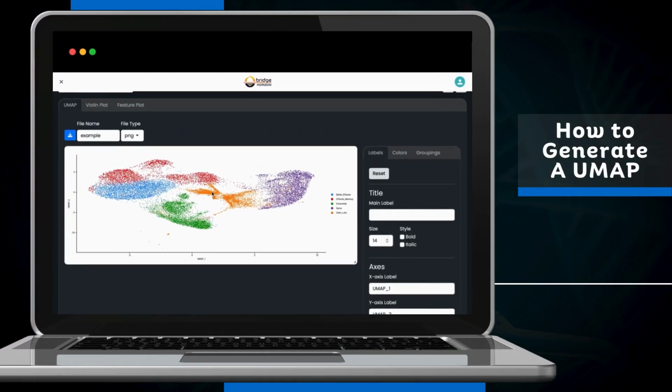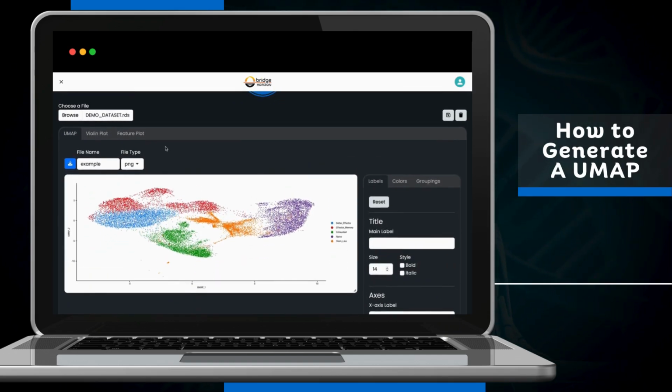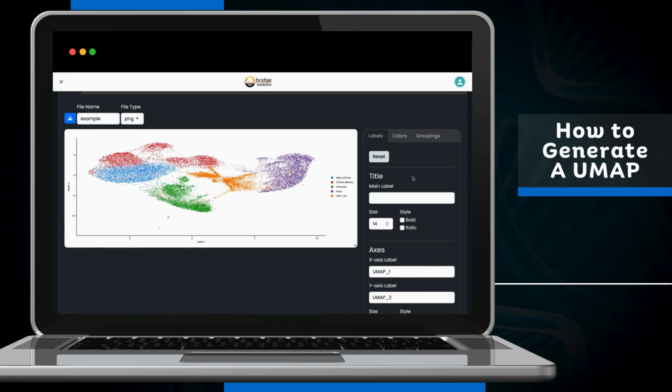In this video, I'm going to show you how you can generate and manipulate the UMAP plot within SCenic Viewer. So once you have loaded your dataset of choice, you'll be immediately greeted with the UMAP plot within the first tab.